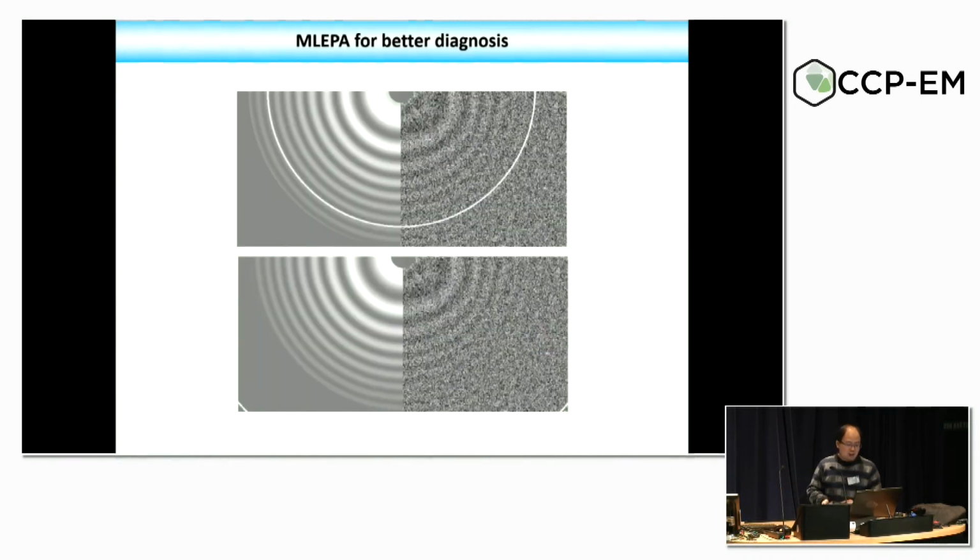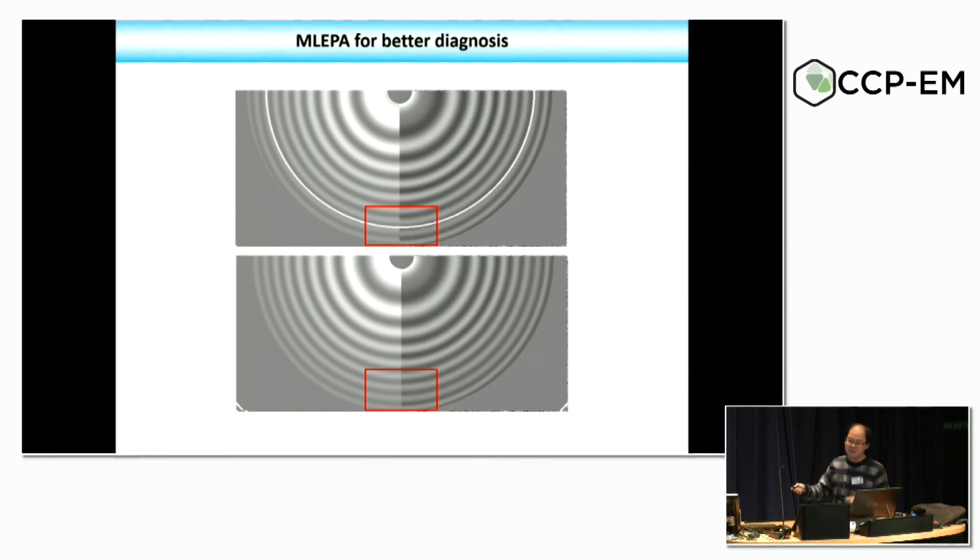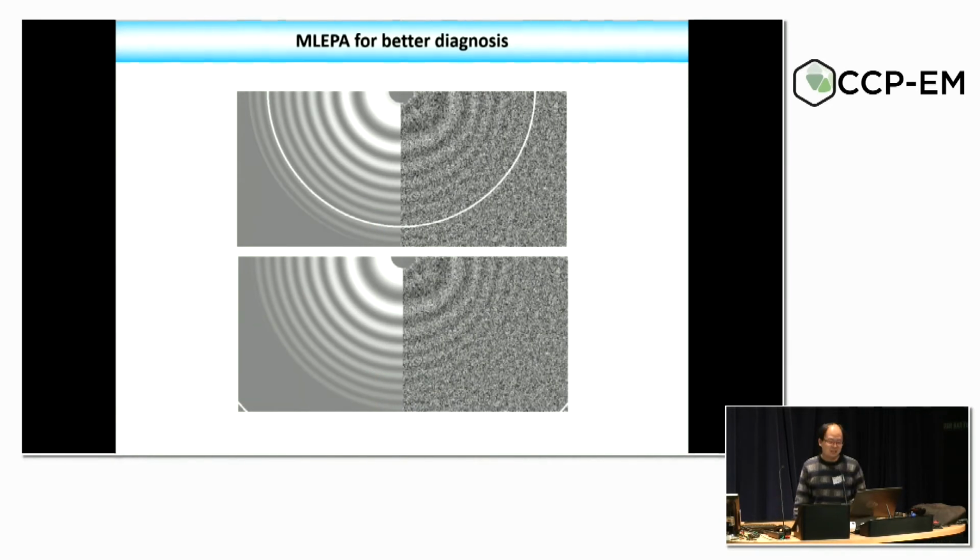which is wrong. And there's another, even more challenging case, and in this case, these two estimations are almost identical. There is only a slight error for one of them. Can you guess which one? Of course you can't, because they seem identical, and all the rings fit very well, but essentially the bottom one, you see a slight error here. From the beginning, you can't see anything.